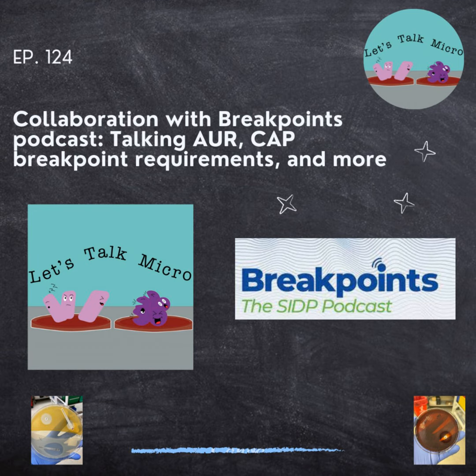If you have no change in the instrument, but you have a change in your EMR or your laboratory information system, the adjustment has to be done in the LIS. And as RJ mentioned before, this is a process that we went through a few years ago. We started moving all our rules, suppression rules, clinical rules from our instrument to our LIS. So we now allow our automated system to transfer all the data with no interpretation, and our LIS algorithms are the ones making the changes to be released to the EMR.